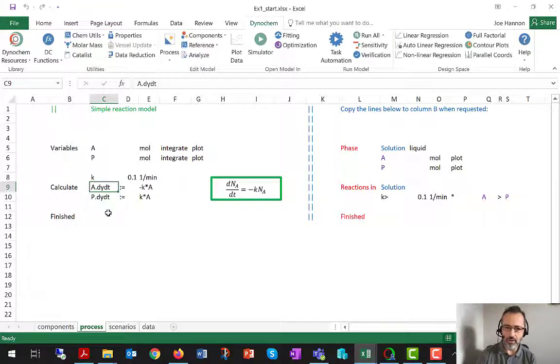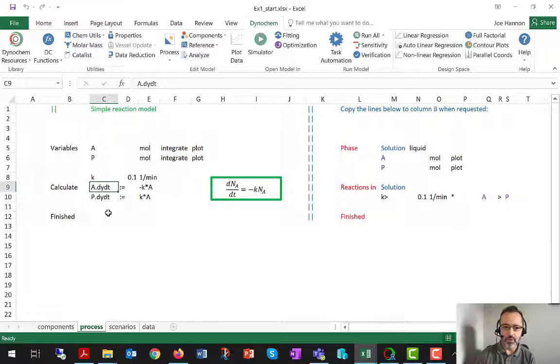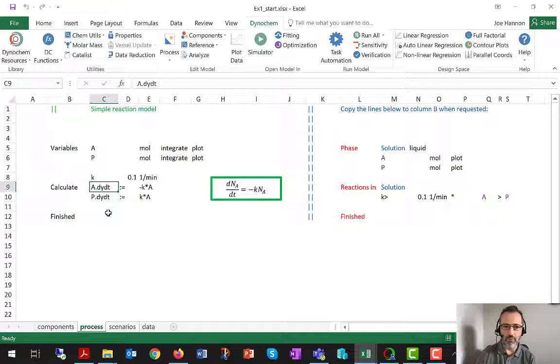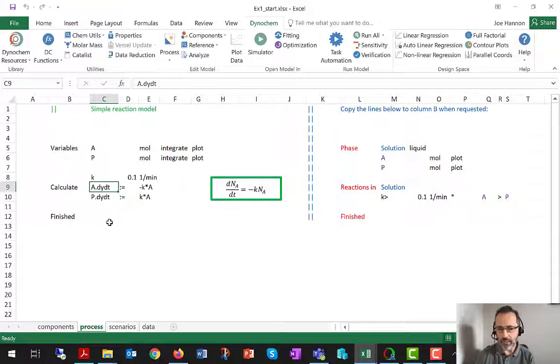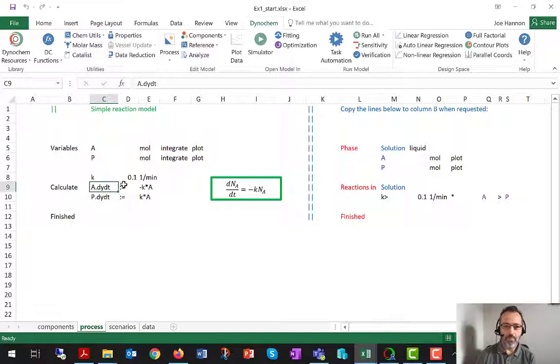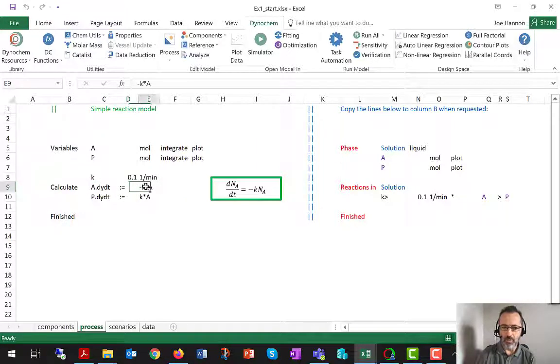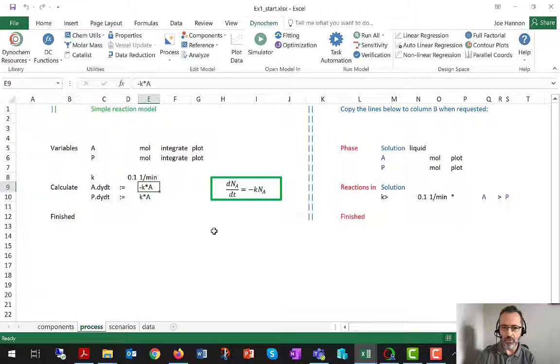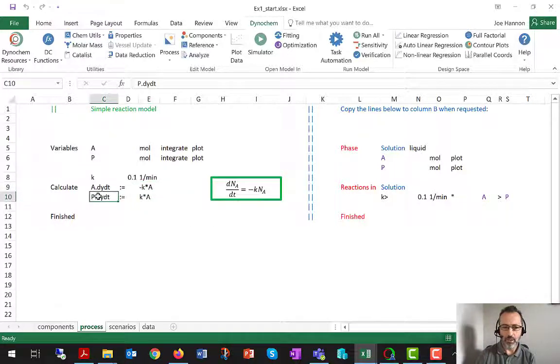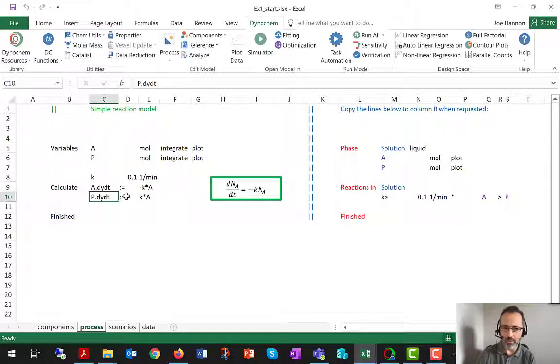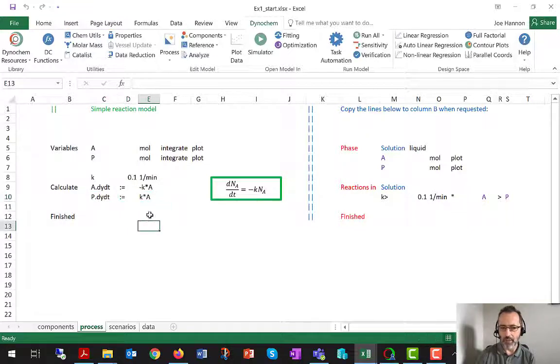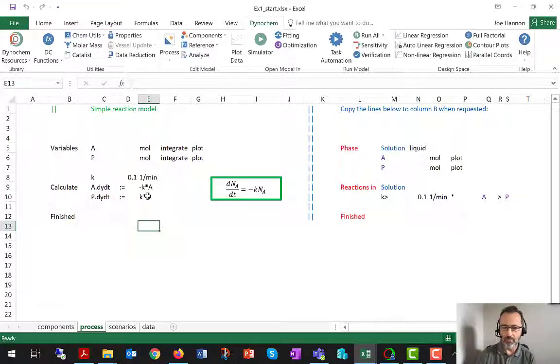Or the older style of that is dot DNDT, but dot DYDT is more readable and my preference. Introduced in Dynachem 5 and 6. So A dot DYDT means DADT. That is going to be equal to minus K times A. That's the rate equation of a first order reaction. P dot DYDT or DPDT is going to be equal to K times A, with a positive sign.